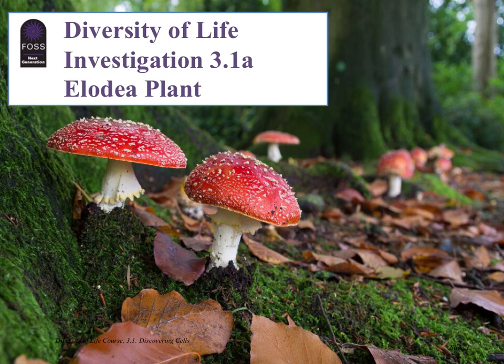As last lesson, Miss Hubbard brought you up to speed on the use of the microscope. The microscope allows us to observe things that are too small to see with our naked eye. Today, we're going to be using microscopes to look at living material to see what we can learn.